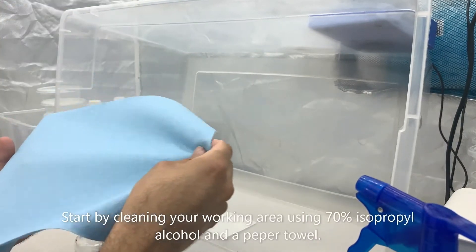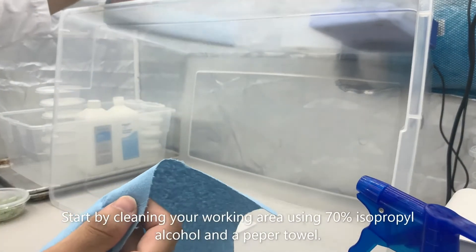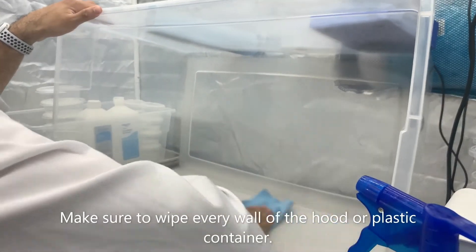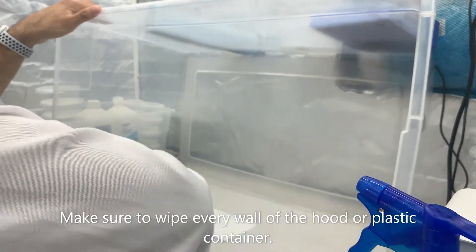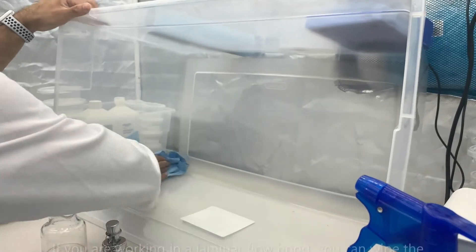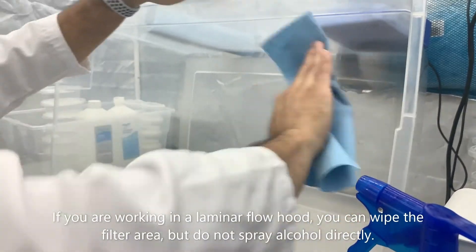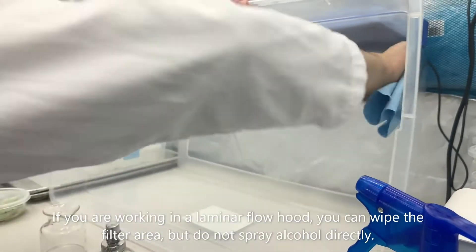We're going to start by cleaning our work area with 70% isopropyl alcohol and a paper towel. Remember to wipe down every wall of the hood or plastic container you're going to be using. If you are going to be using a laminar flow hood, you can wipe the filter area, but remember do not spray the alcohol on there directly.